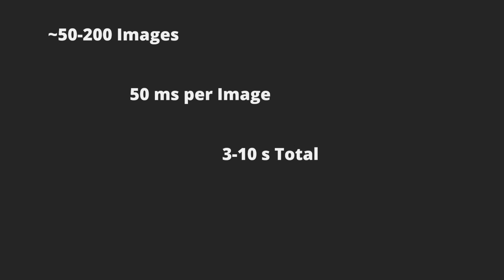We usually take 50 to 200 images, so if one image takes 50 milliseconds to capture, the entire acquisition takes around 3 to 10 seconds. This triples for an RGB image, preventing real-time reconstruction. Therefore, it is crucial to automate this process to reduce unnecessary delays.